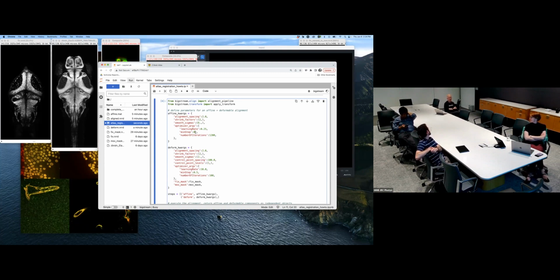So Greg, I have one more question. Let's give a scenario here: you have an atlas, you have ROIs in that atlas, and then you have a series of experiments over time where you have a 3D object over time. Would you take the ROIs and move them to the object, the time series data, or would you move the time series data, transform that, and then take the same ROIs within the Atlas space to that?